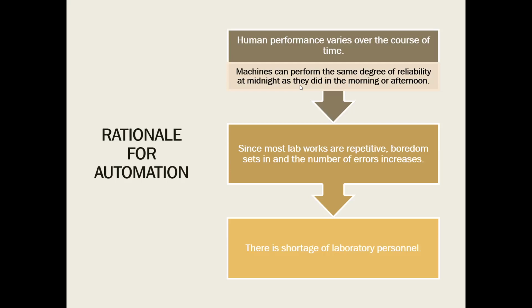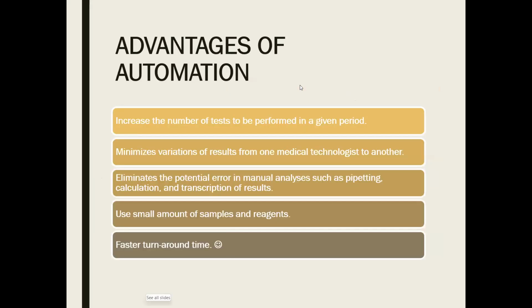However, kahit po siya ay can do the same reliable test or same accurate test, we must be able to do the standardization, the controlling of our machine. Now, take note that since most laboratory work is repetitive, boredom sets in and the number of errors increases. Yun yung isang dahilan, ulit-ulit ka na lang, parang nagiging complacent ka na, nagiging, ay, okay, parang alam ko rin. No, it shouldn't be like that. And lastly, there's a shortage of laboratory personnel. Even nowadays, there is still a shortage in the laboratory personnel.